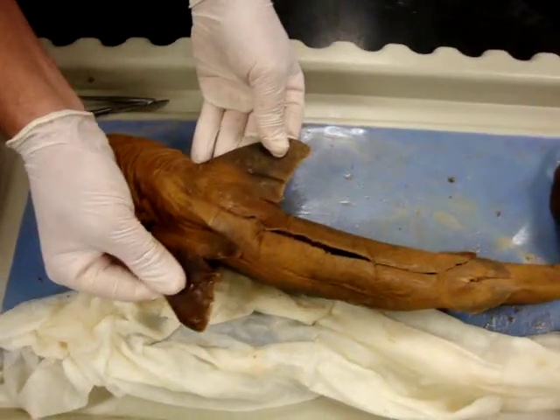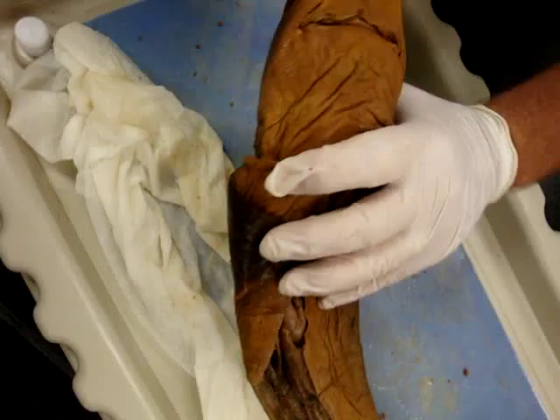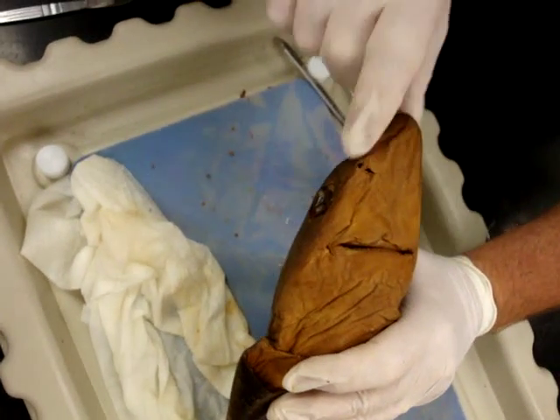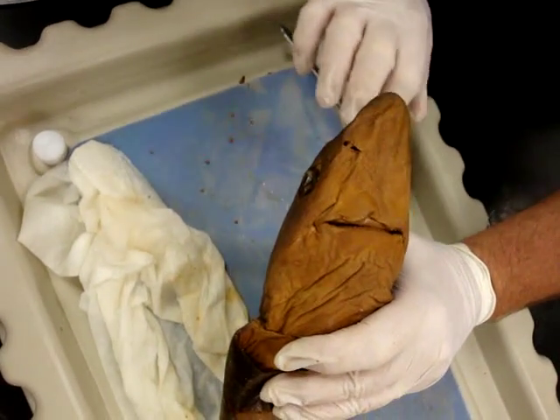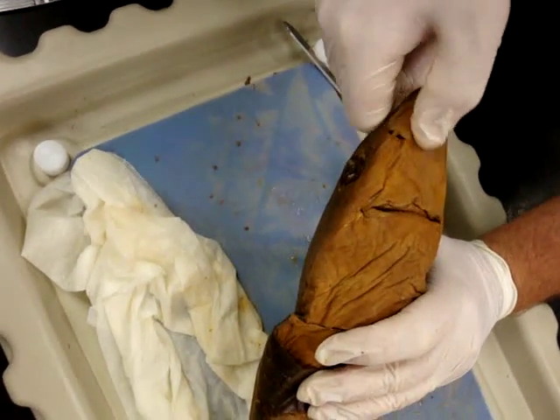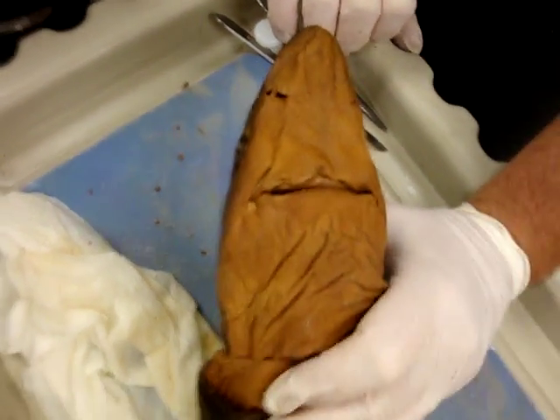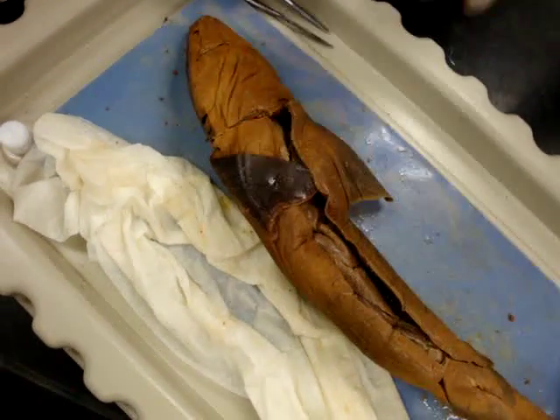Here we have two pectoral fins and two pelvic fins. Up near the nose, we have two nostrils — sensitive to smell, but not for breathing. And then these little pits up here, these little freckles: those are pits and each one of them houses an ampulla of Lorenzini, sensitive to electrical fields.